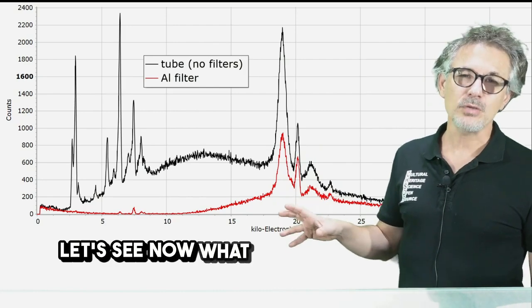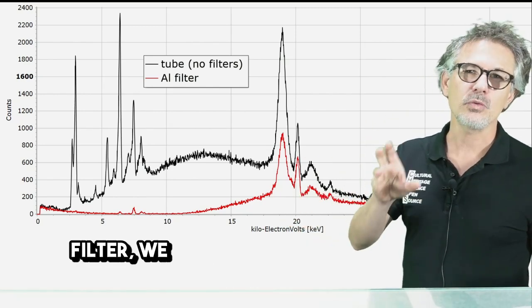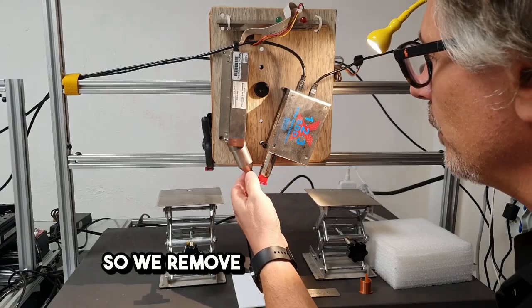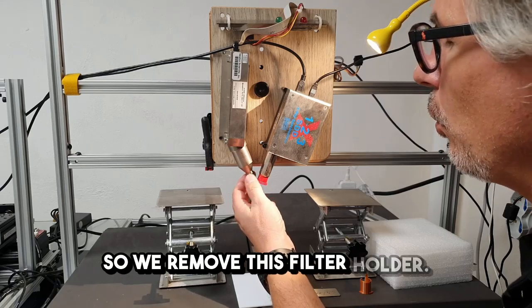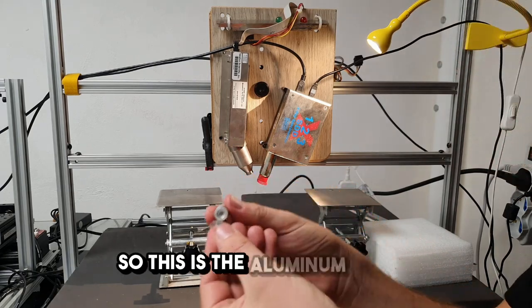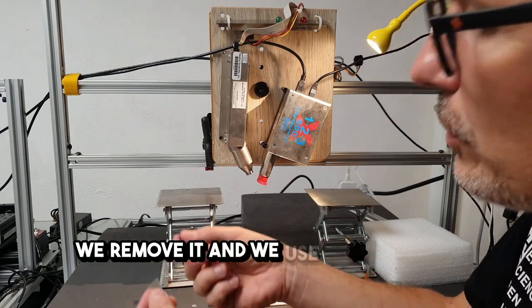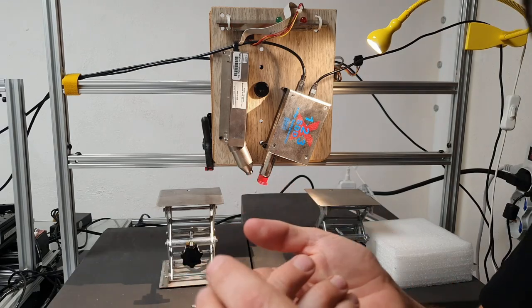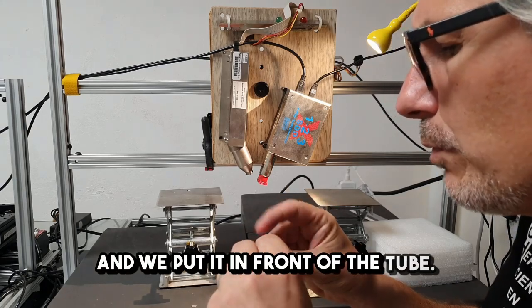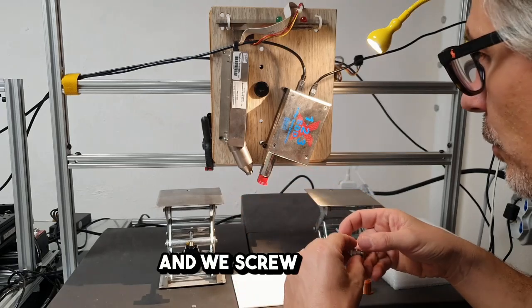Let's see now what happens when instead of the aluminum filter we use the tungsten filter, just that one. So we remove this filter holder. It's over here. So this is the aluminum filter. So we remove it and we use the tungsten filter. There it is, and we put it in front of the tube. Okay, there it is, it's in position, and we screw it back.